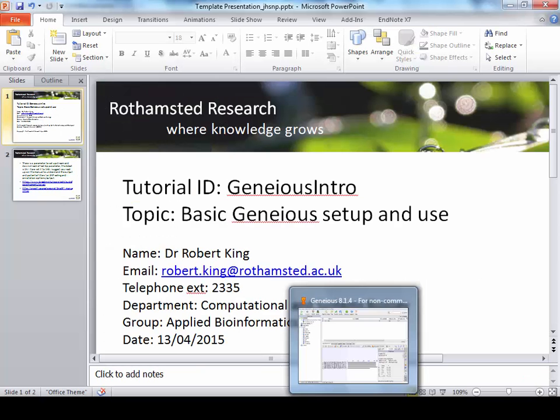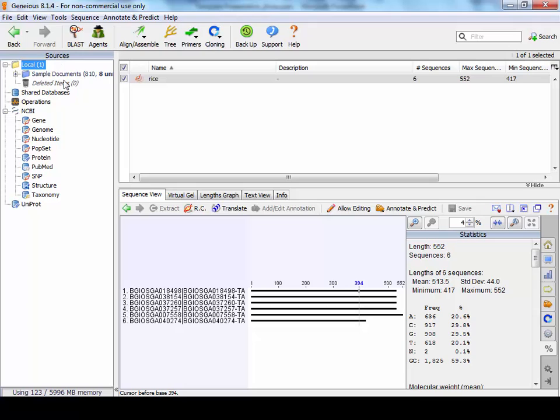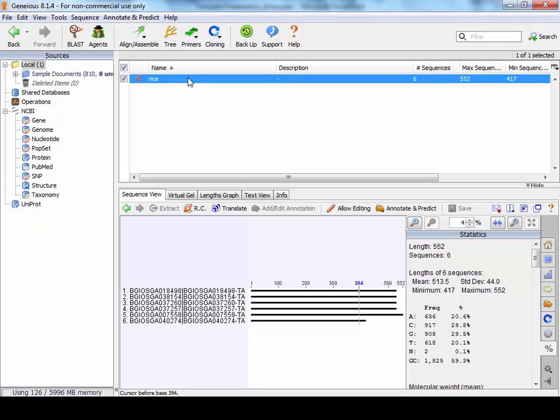When you first load up Geneious, what you'll get is your directory structure on the left pane. Whatever directory you're in, the box here will have those files. If you select on a file like we have here, you'll see the contents of that file here.